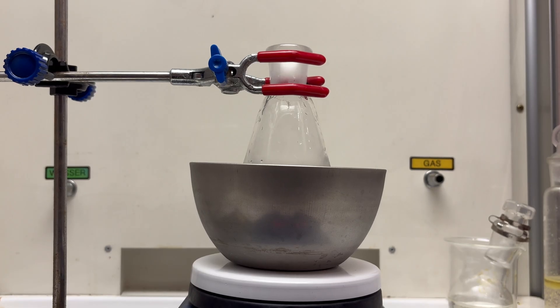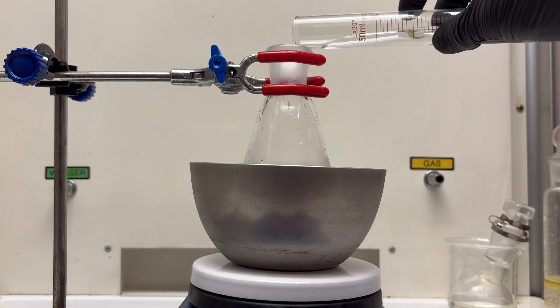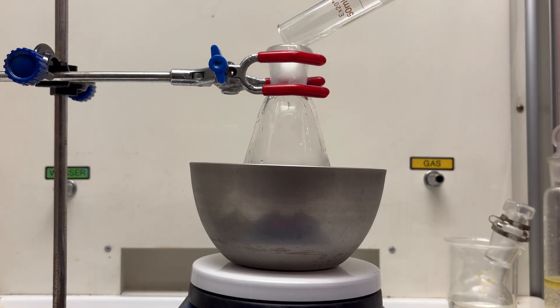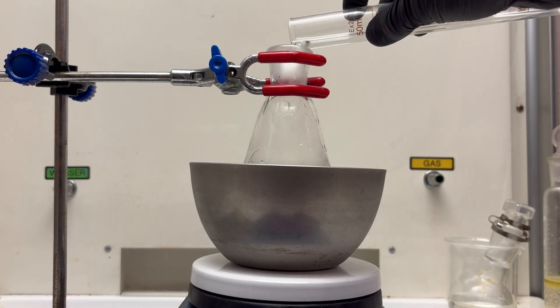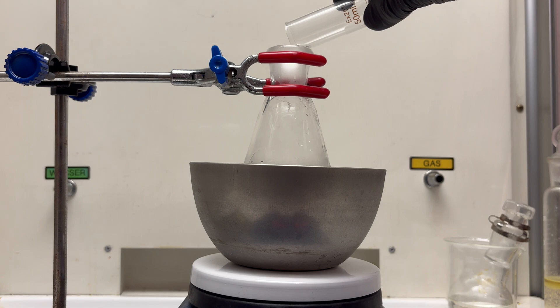First, to a flask there was added 18 milliliters of distilled water as a solvent. Then I'll add 32 milliliters of concentrated hydrochloric acid.